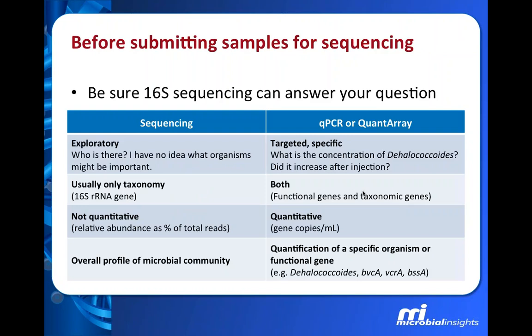Next generation sequencing is a fantastic tool for attempting to link site management to microbial community composition. There's been no tool, our PLFA, DGGE, any of these other tools, that have come close to delivering the amount and the resolution of information that's provided by sequencing. And once we get to metagenomics, we can see so much more and be able to tie those functions in. And it's just going to be a really incredible and powerful tool. But before you submit your samples for sequencing, just make sure the result you get can help you answer your question.